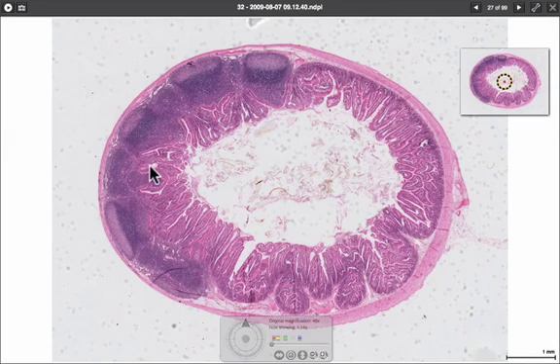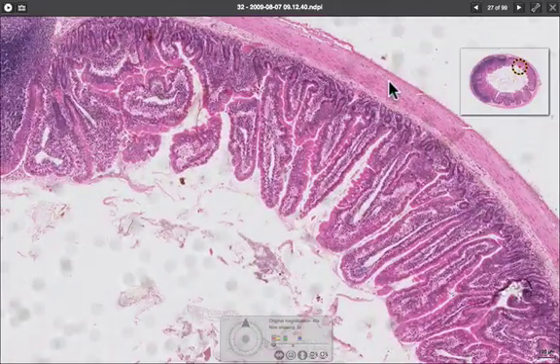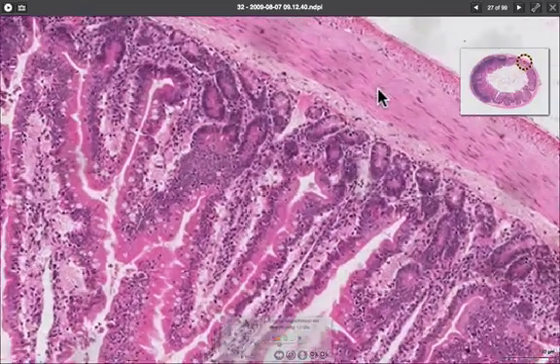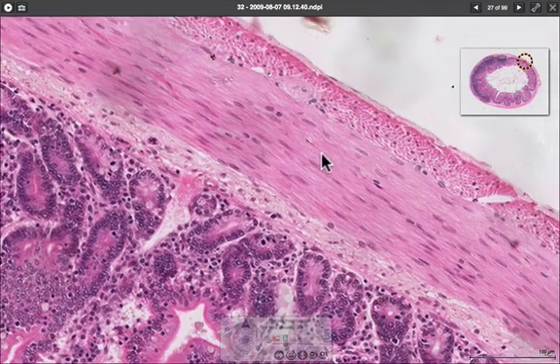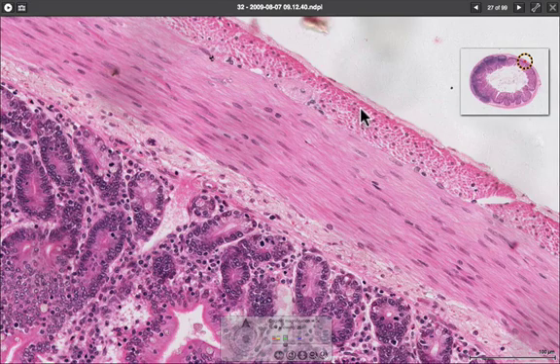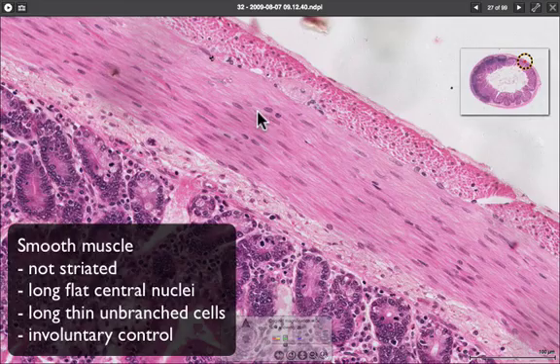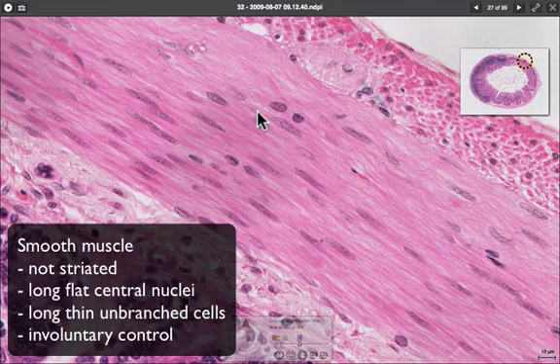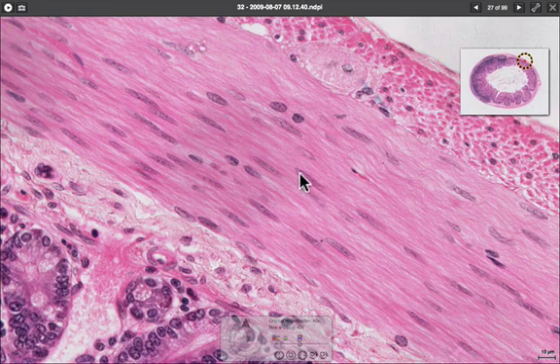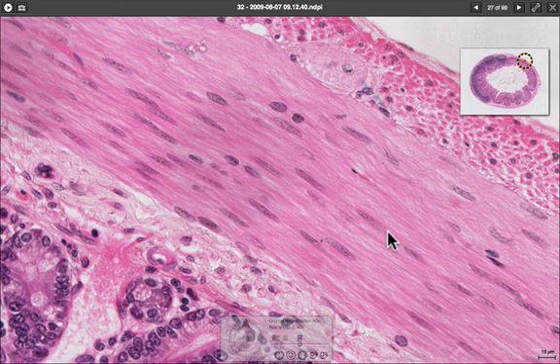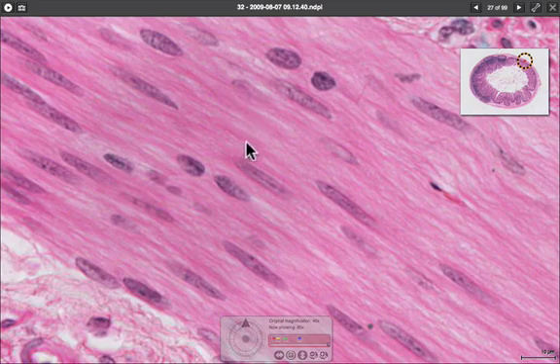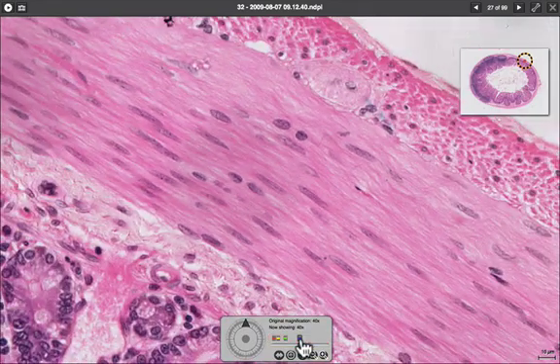To show smooth muscle, this is a cross-section of the ileum in the small intestine. Around the outside we can see the muscle fibers — an inner circular and an outer longitudinal muscle layer. Looking at the inner circular layer: the cells have very long, thin nuclei, and the cells themselves are long and thin. Crucially, there are no striations whatsoever — this muscle is non-striated — and the nuclei are flat and central to the cell.